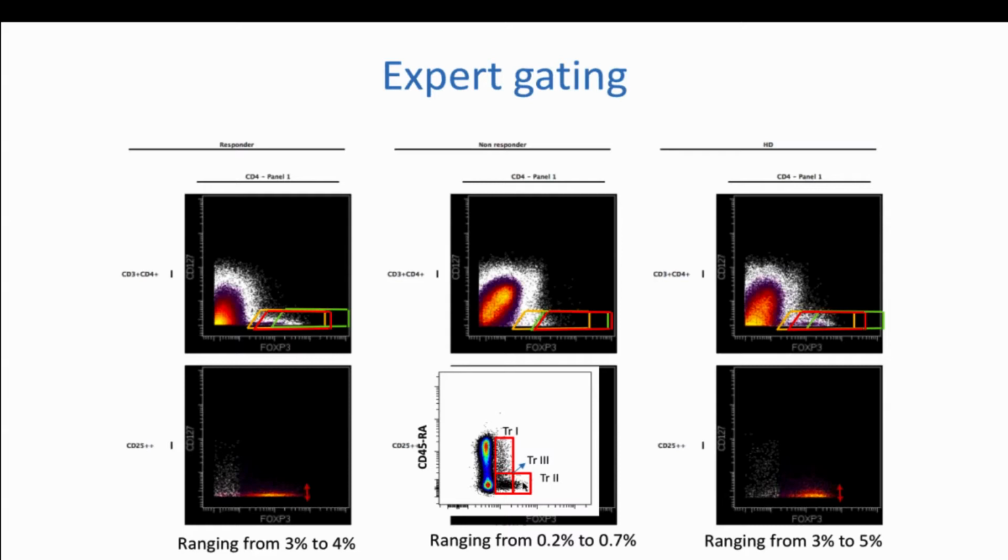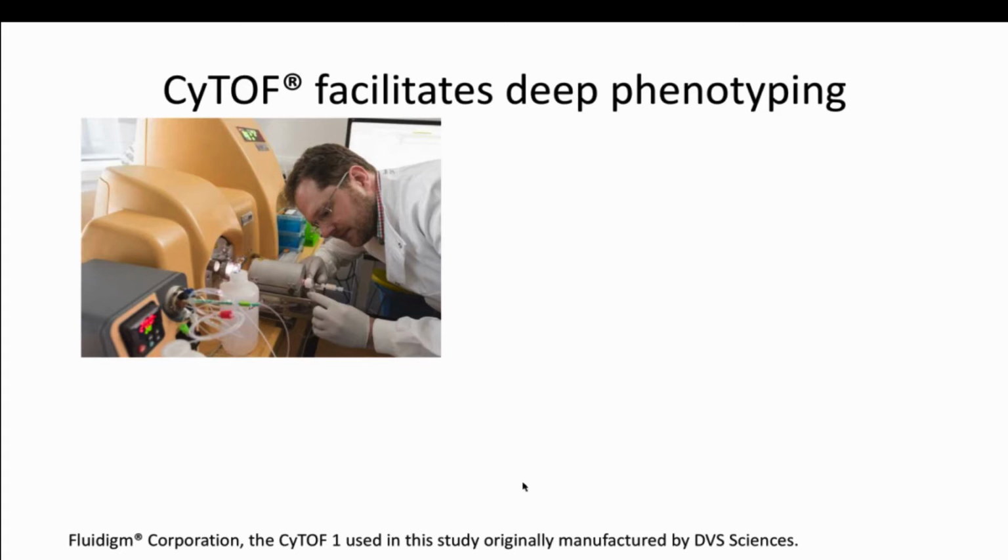So we decided to go for using CyTOF as a way of deep phenotyping for Tregs. And I hand over to Richard to explain how we used CyTOF for this.